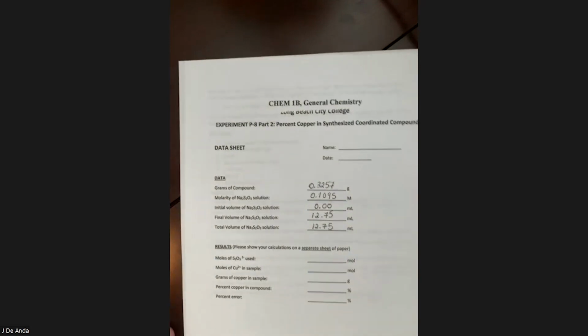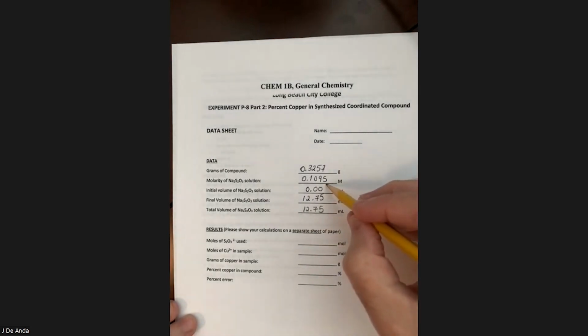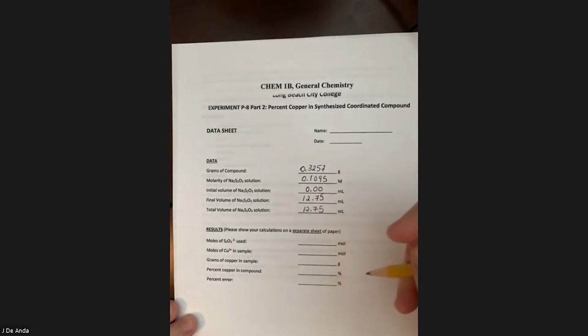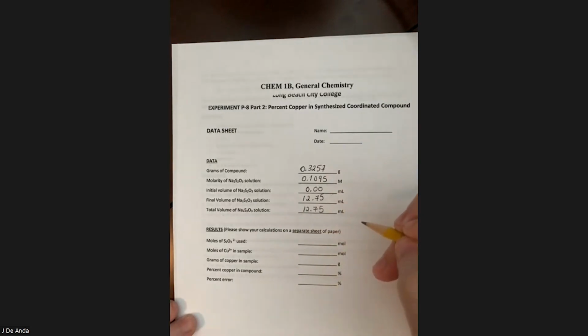So here is a sample data set where you have the grams of compound, you have the molarity of sodium thiosulfate, which is probably not the same as the one you did. This is the simple titration. We use 12.75 milliliters in order to titrate that amount of copper.